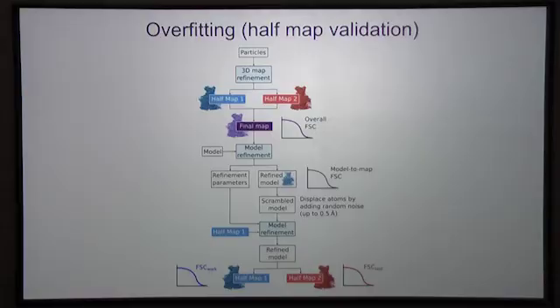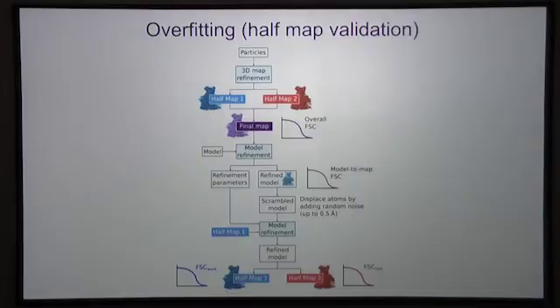And so we developed this system where you take your model, you refine it against your full final post-processed map, and from that you generate your refined model and also the refinement parameters that you used to generate that refined model. You then take your refined model and you scramble the atoms inside that model. So you add displacement values to each of these. And the idea is to shake it up to remove any kind of model bias.